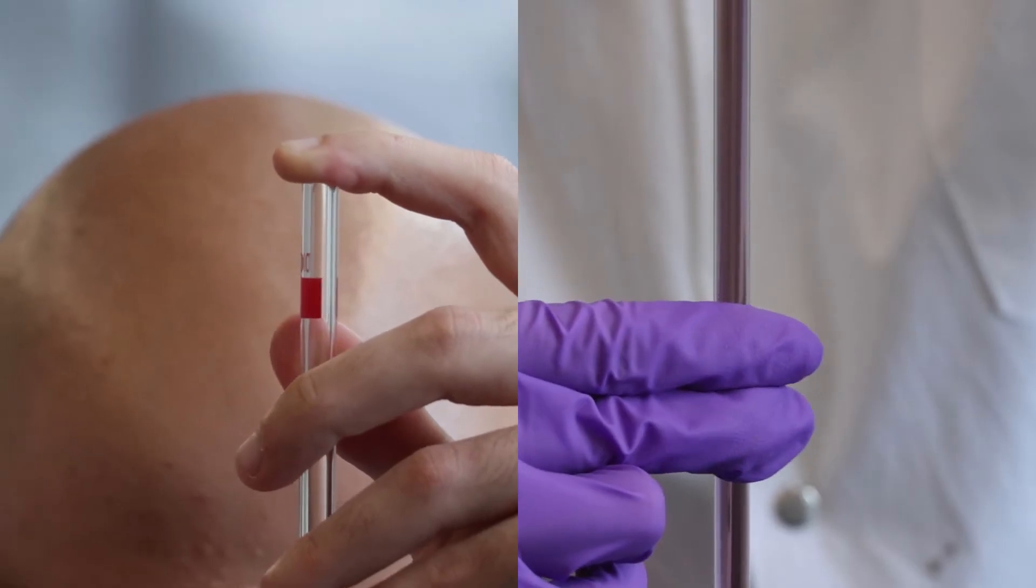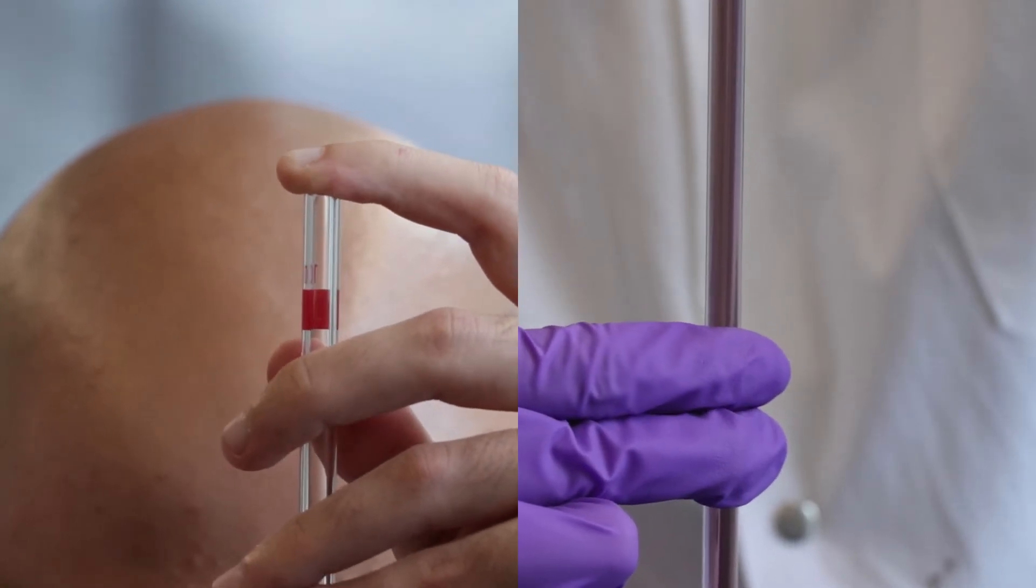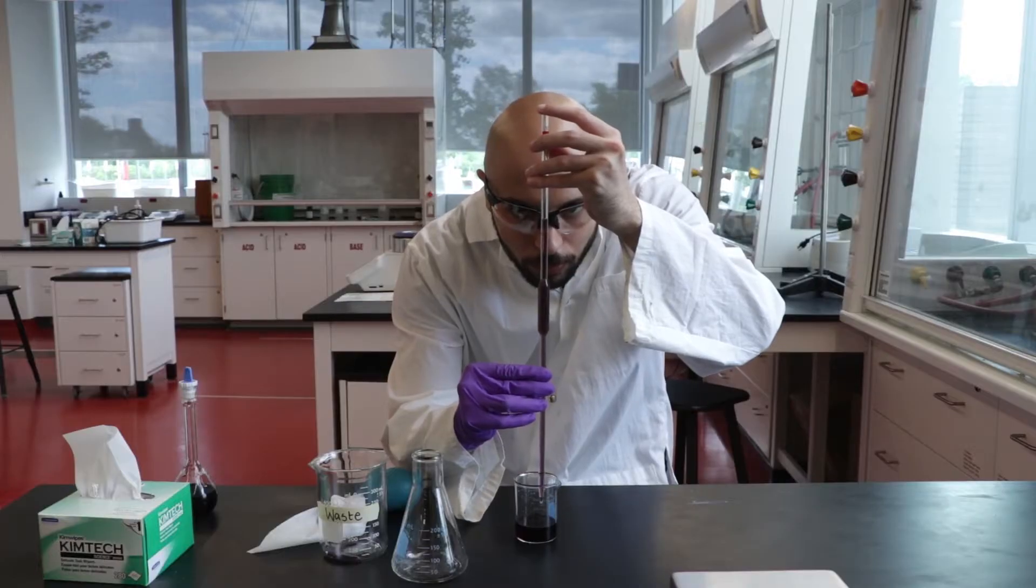Carefully and slowly adjust your index finger while twisting the pipette to release the liquid until the bottom of the meniscus rests on the etched mark. This will take some practice.